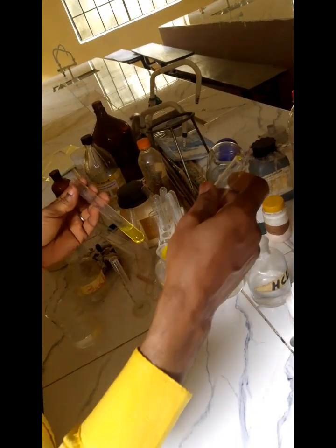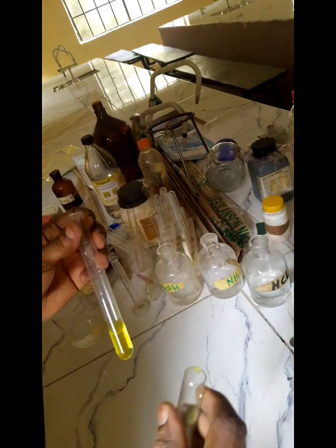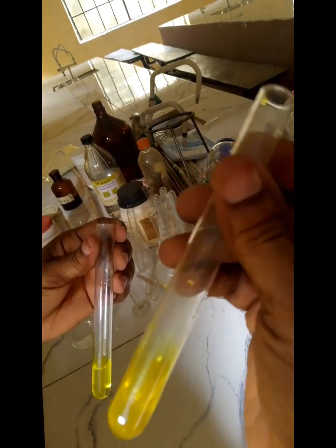That is a reduction. The sulfite ion is reducing this oxidizing agent. Look at the yellow, it's pure yellow. Look at this other one, it's yellowish green or greenish yellow, so to say. But this is the main yellow color.